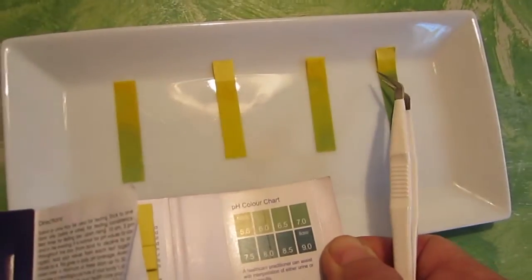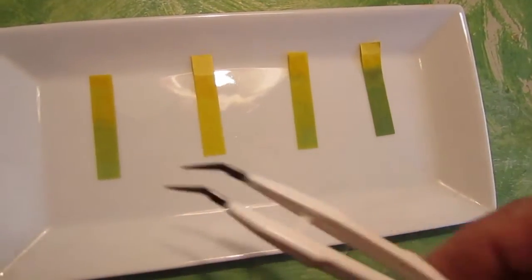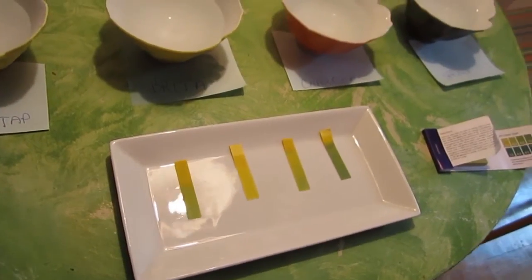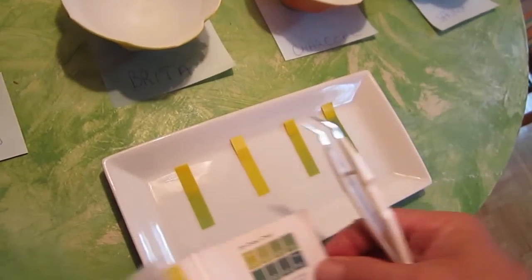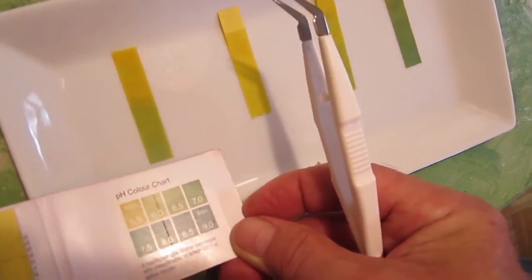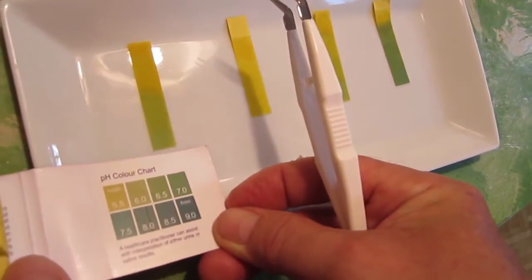It's still very light. And the Toronto tap water is not bad — it's probably 6.5 on the pH scale, even close to a 7, so it's almost neutral.